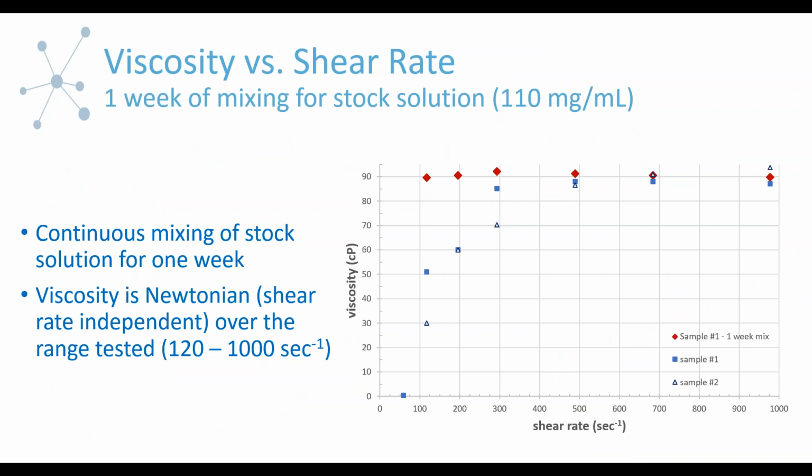Okay, so now that we've thought about our samples and considered other preparation options based on the literature and the whole polymer dissolution process, we continued to mix this solution. It was continuously on a slow rotating mixer for a week-long period. And again, we're still looking at the stock solution.